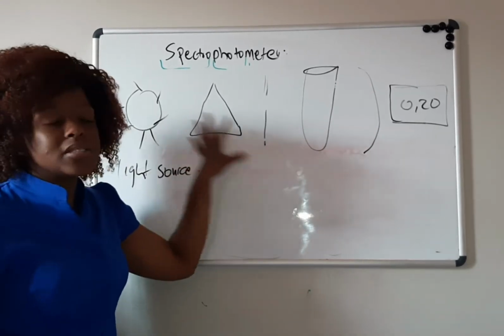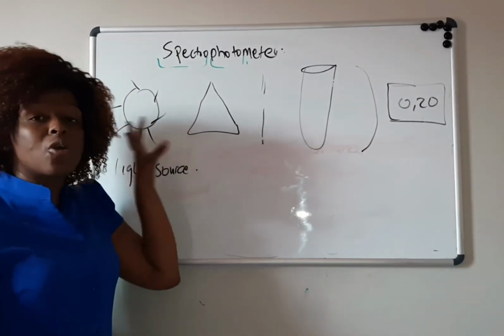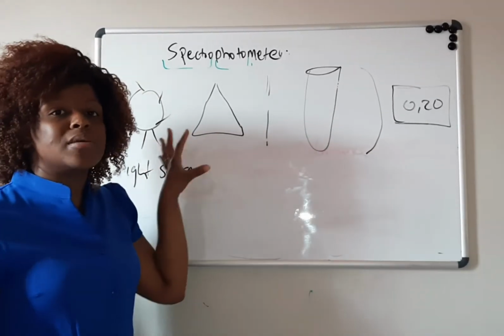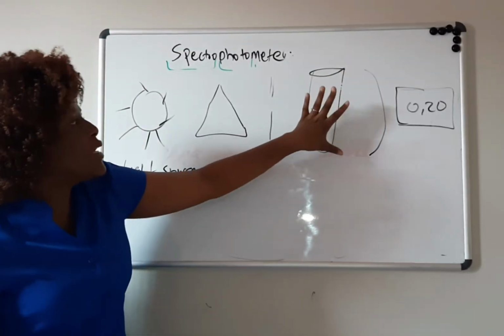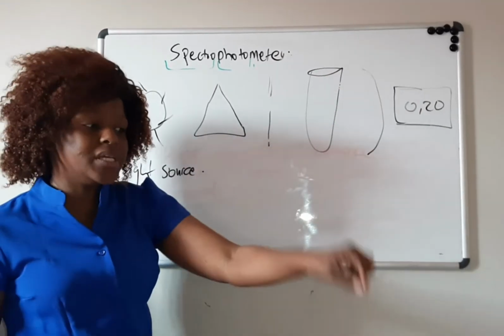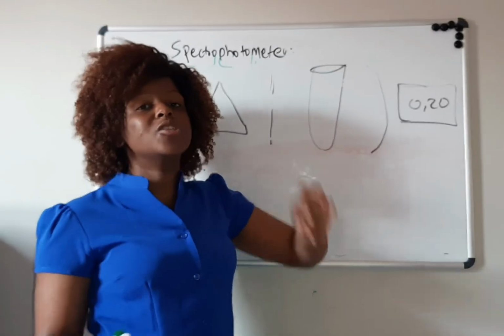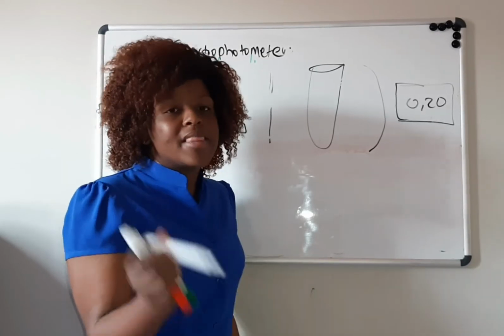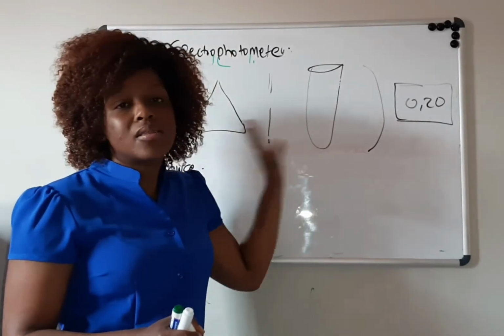This is how a spectrophotometer measures the light absorbed or transmitted, at 180 degrees. As you can see, it is a straight line, and these are the components that will be in each and every instrument that uses spectrophotometry as a principle. The cuvette, like I said, contains our patient sample and the reagent. Sometimes you might have to put in the cuvette yourself if it's a manual spectrophotometer, but if it's a spectrophotometer in an instrument, you'll find that there are already several cuvettes in the instrument, which it uses interchangeably for measuring the samples.